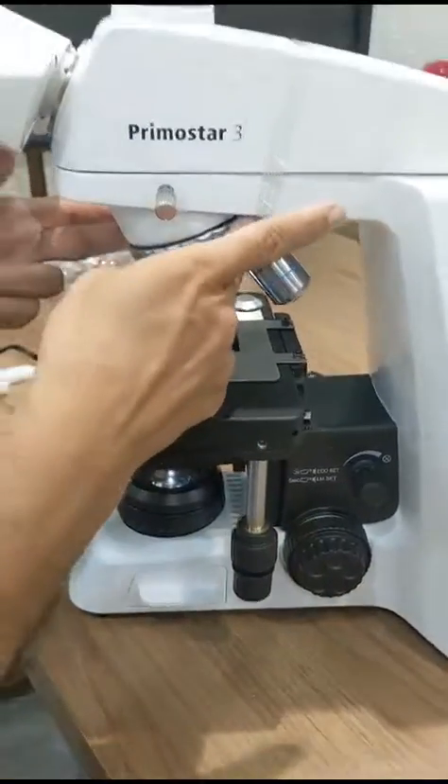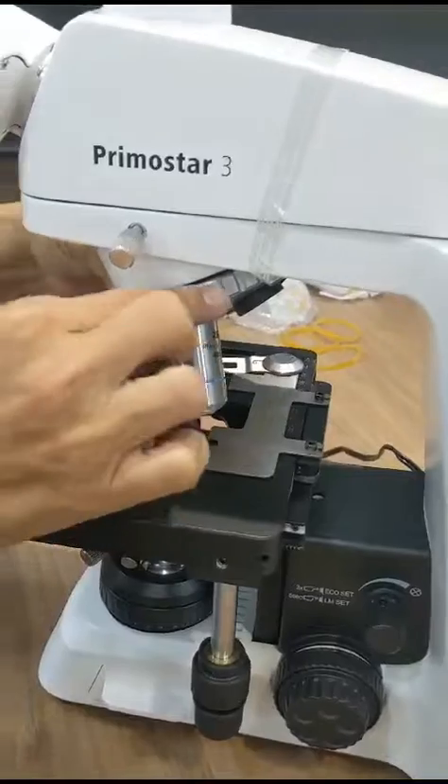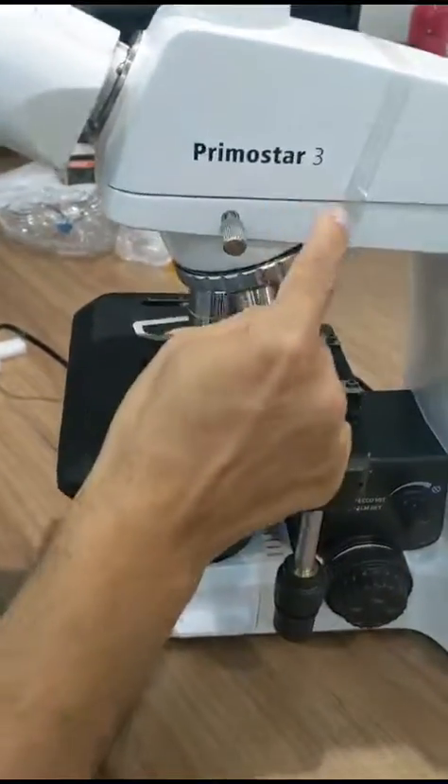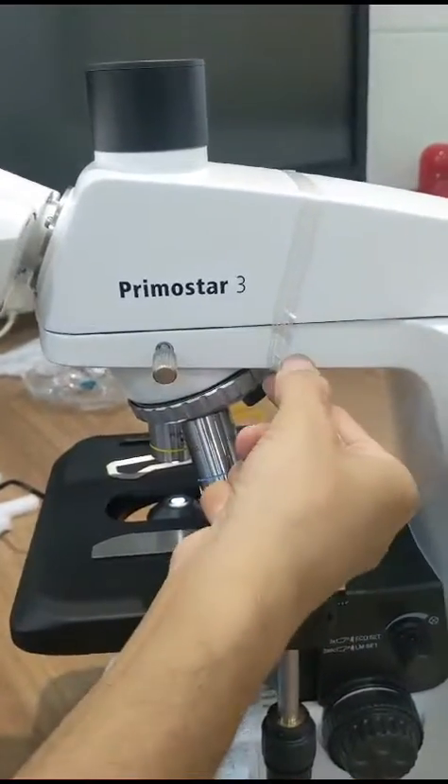This is the light intensity on/off switch. These are the coarse and fine focus controls, the X and Y shifting for the sample stage. You can change the objective by holding the nosepiece like this.